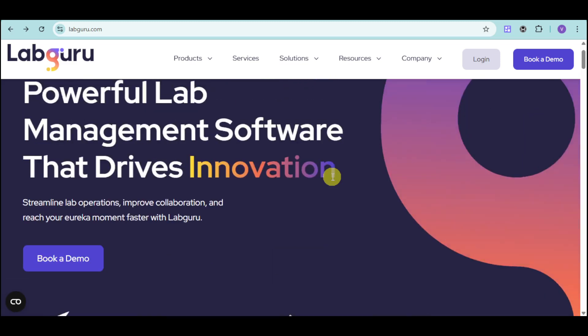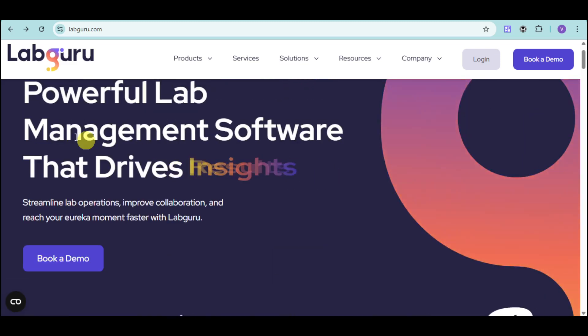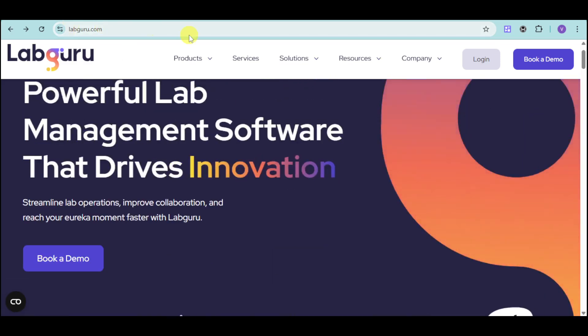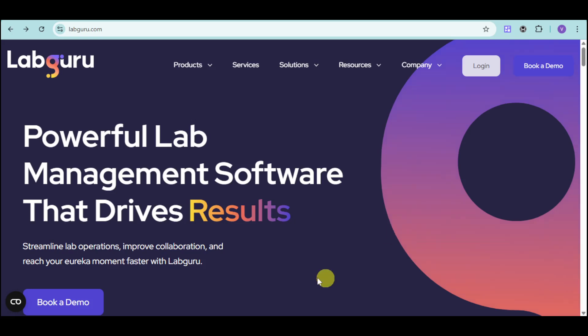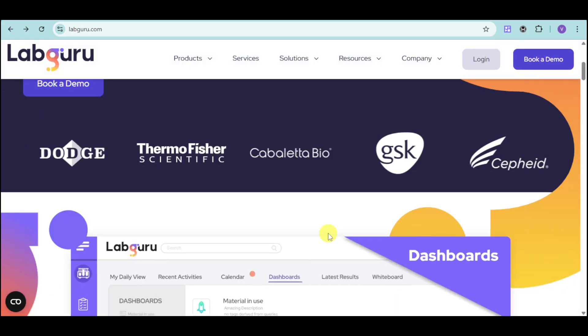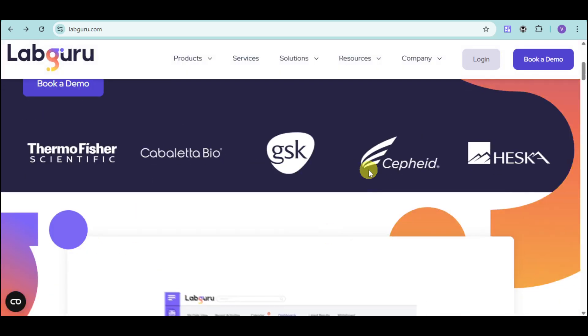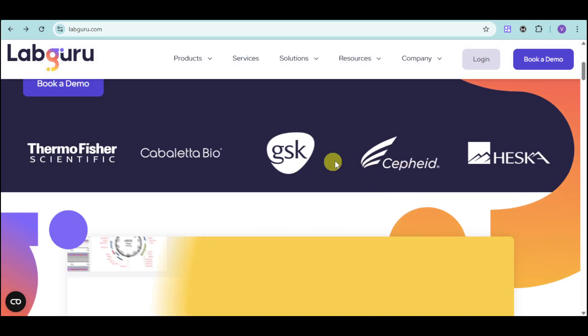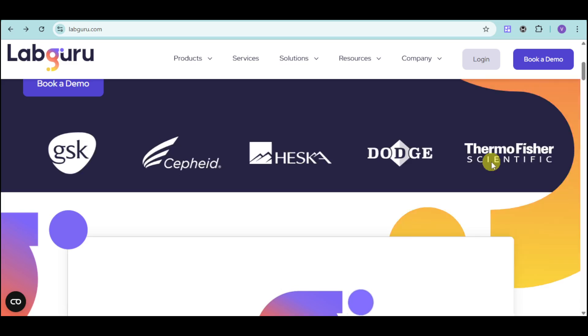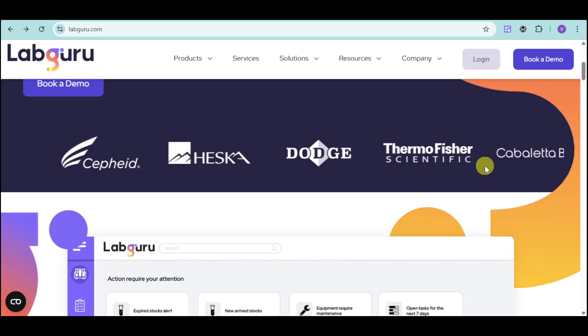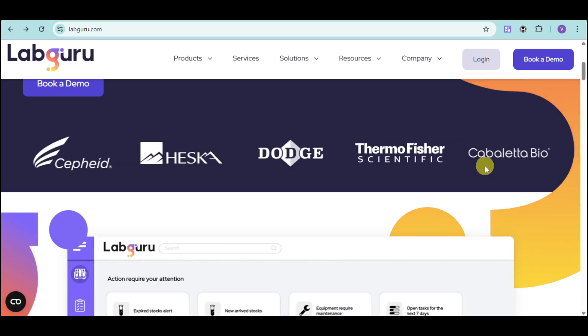First things first, you just need to head over to their website, which is labguru.com. From there, you should be able to see all of this. Here are some of the labs that actually trust them. We have Cabaletta, Cepheid, Heska, and Thermo Fisher, which is actually a really big lab.